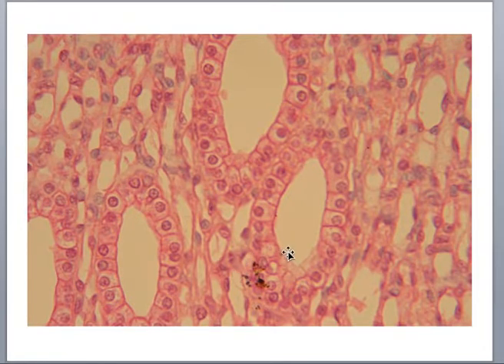So this is higher magnification, and even though these aren't nice and super spherical tubules, they're somewhat elongated, you can still tell, on the outside, this would be where the basement membrane is, and then here, this would be the tubule, the lumen of the tubule. This would be that apical space. And look at those beautiful simple cuboidal epithelial cells with that very spherical nucleus located smack dab in the center, okay? So if I'm asking cuboidal, it will be in a tubule shape because you are beginners, and that's the easiest way to identify simple cuboidal epithelium.